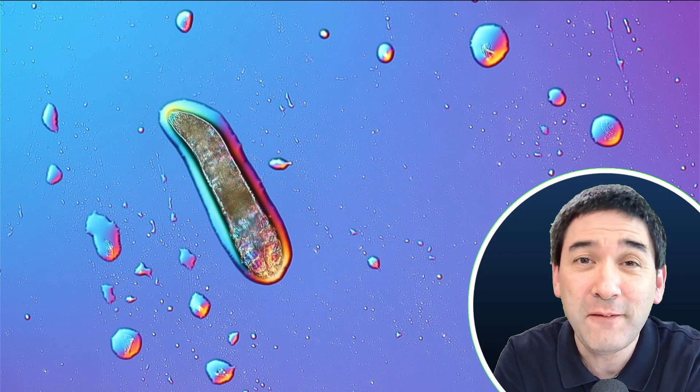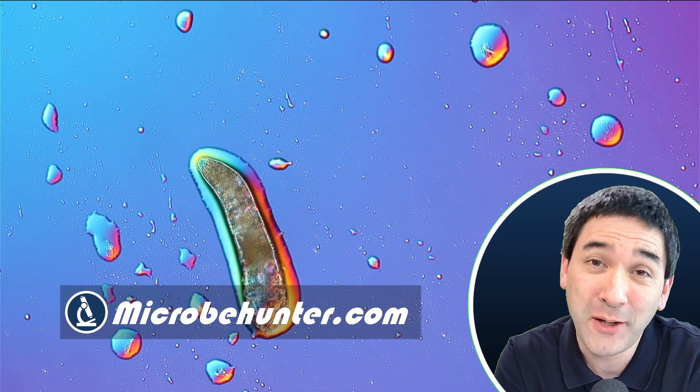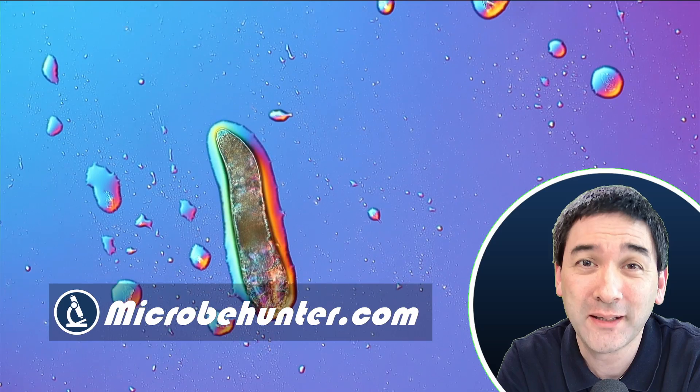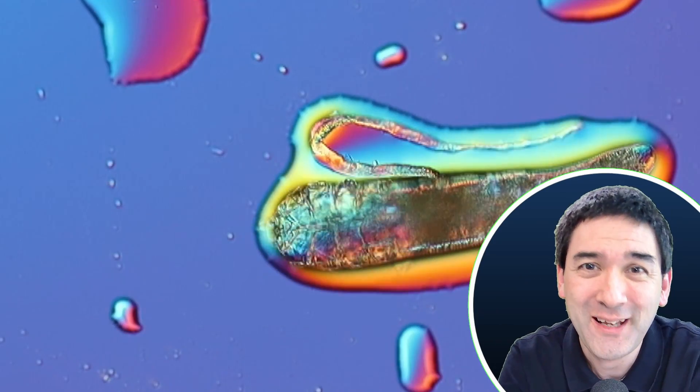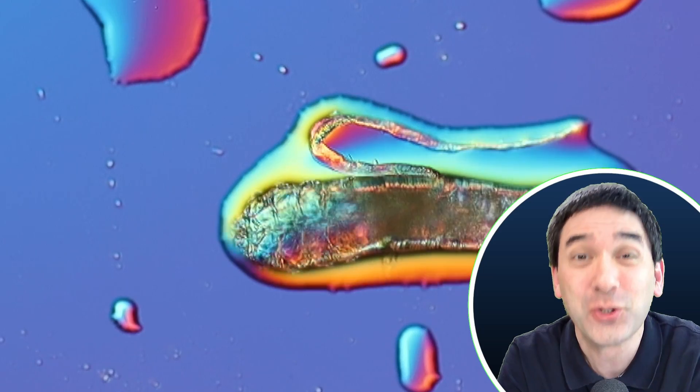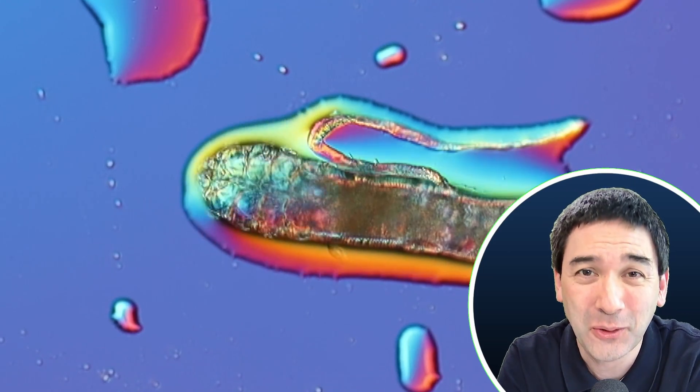This here is not a worm — it is a facemite. Today I would like to show you how you can catch those facemites, because they're growing right here in your eyebrows and how you can put them under the microscope, just like I have done here. Hi, hello and welcome. Microbe Hunter here.